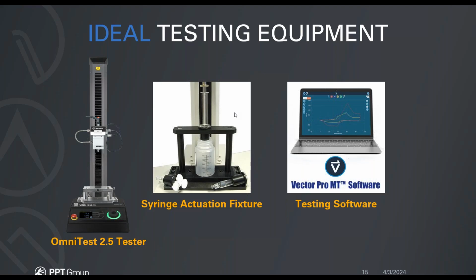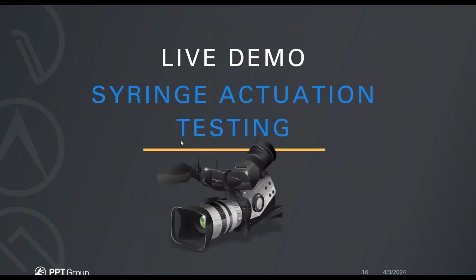Now, the combination of all of these allows for repeatable and consistent testing. That way, each operator is doing the exact same thing at all times, and there is not too much variability in the actual test results that are generated from these tests. So we will look at each of these components in the live display here in just a second.